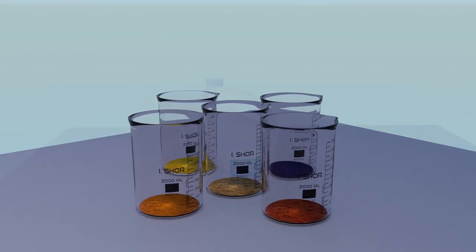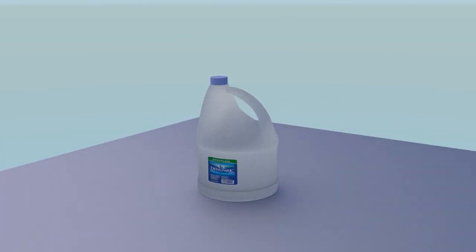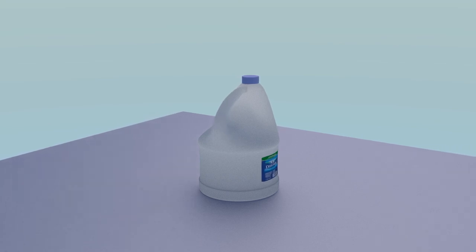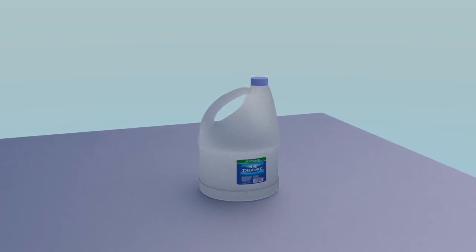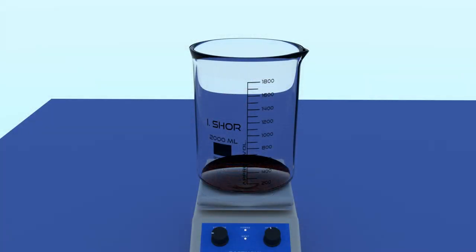But before we do that, let's rinse them clean of any ammonia residue. For this, we'll use distilled water, because we don't want to leave any residue of minerals from either tap or spring water. After rinsing with either distilled or demineralized water, place the beaker on a hot plate, drying the mud.